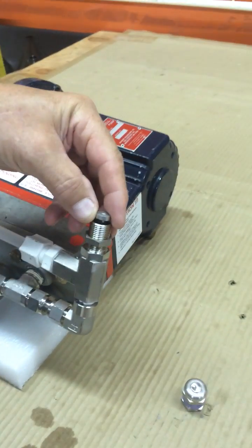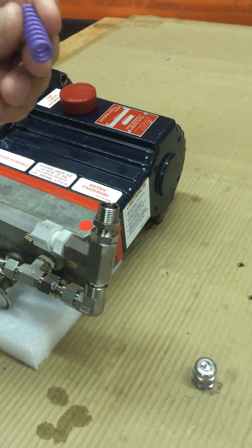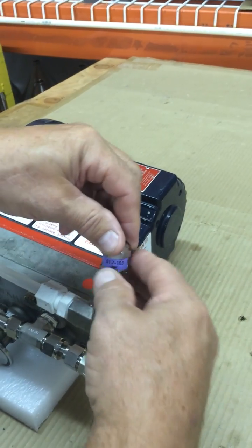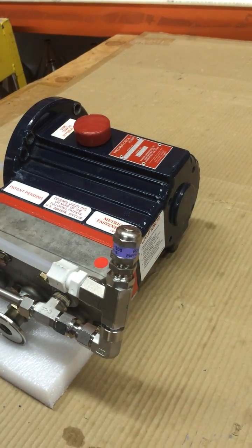Put the valve in, the spring, the cap, and start the machine.